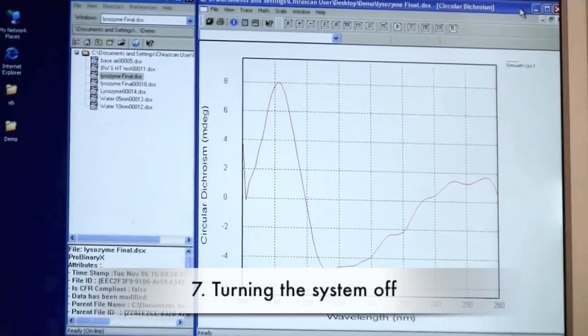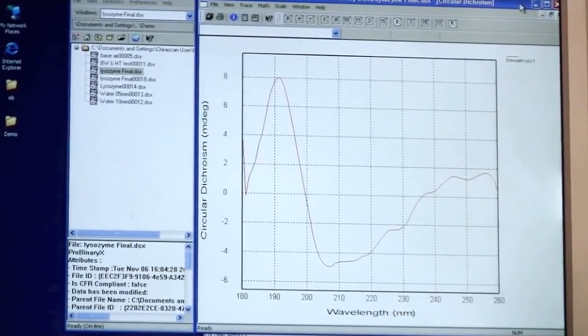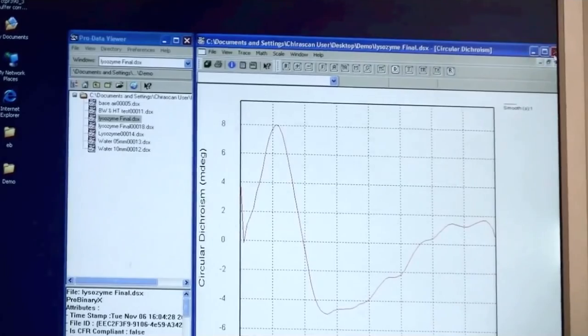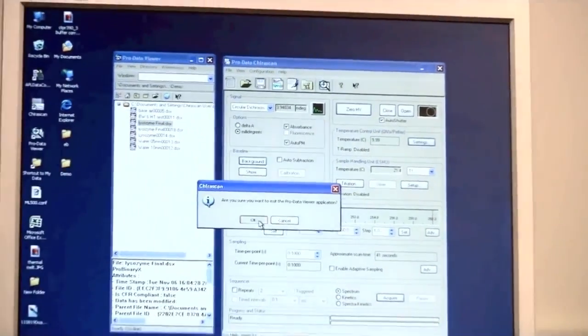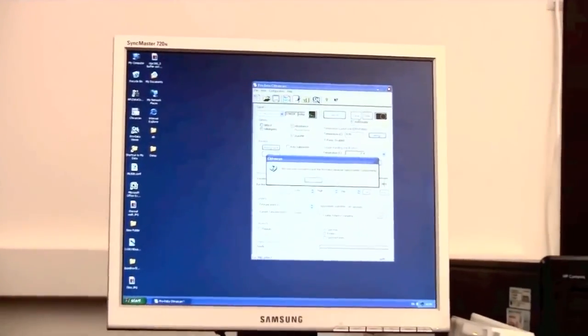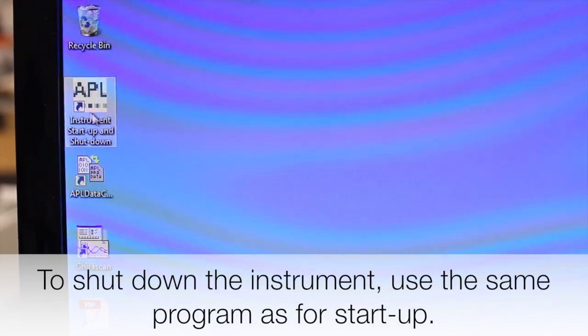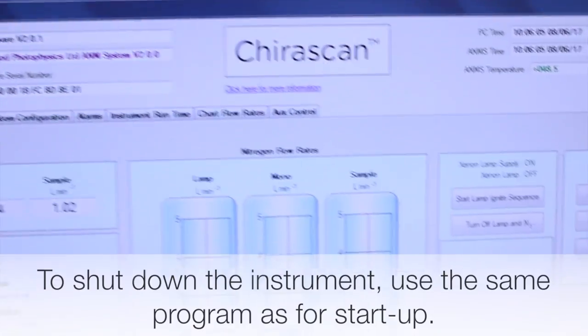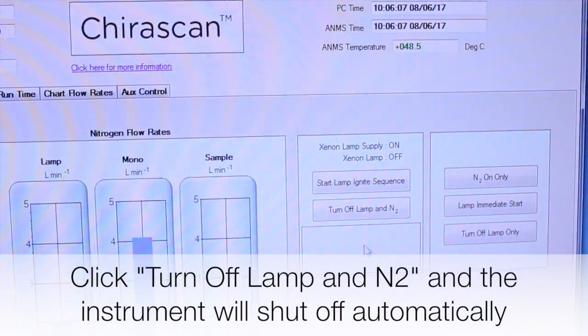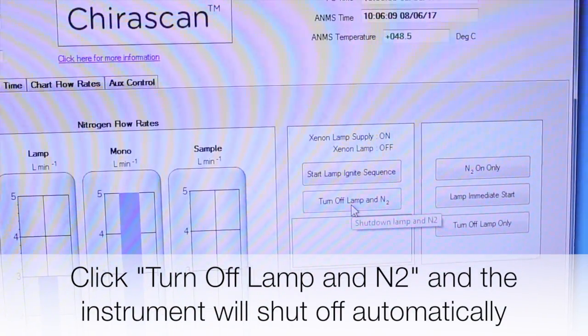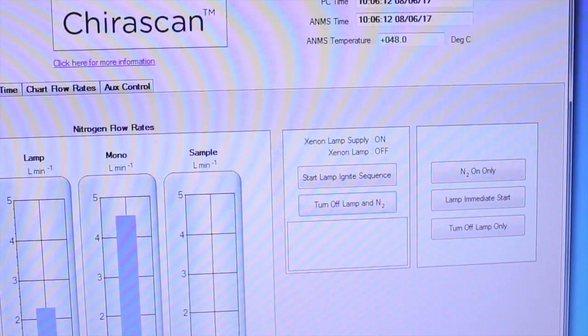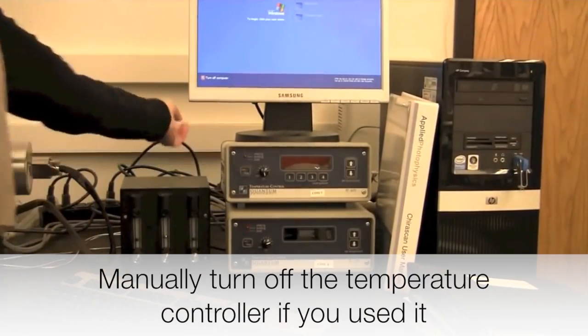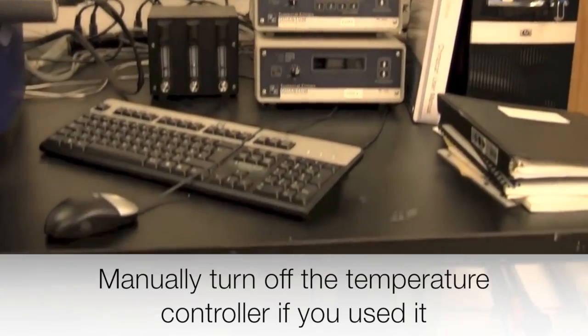In the end of the day, when you have finished all your experiments and you want to turn off the system, you will close down the software and it will ask you if you are sure that you want to close it and you will say yes. You will turn off the circulator on the bottom.